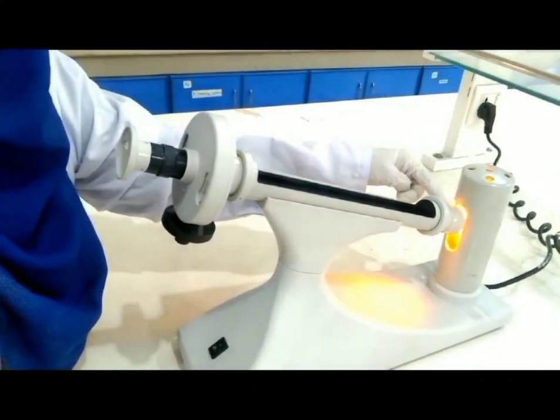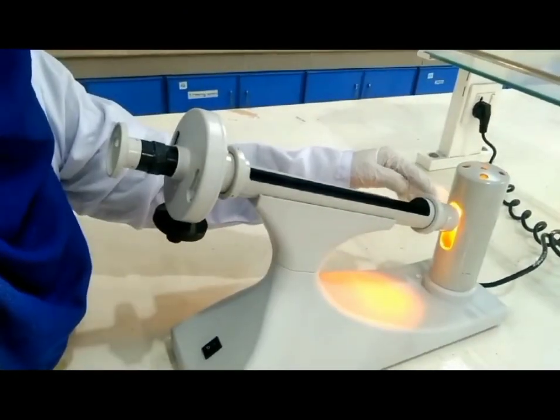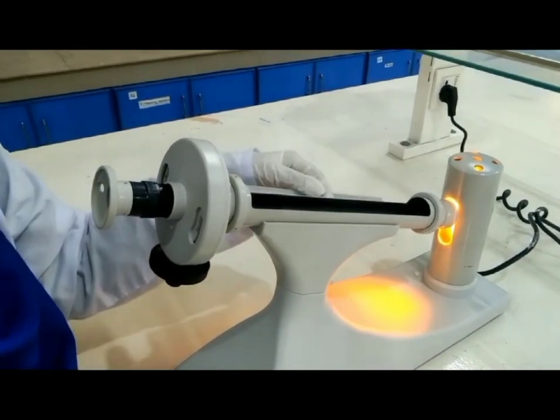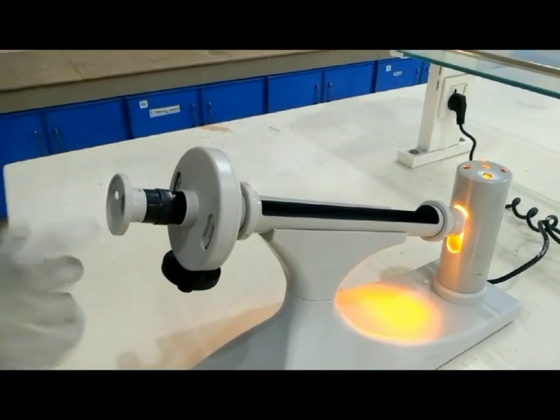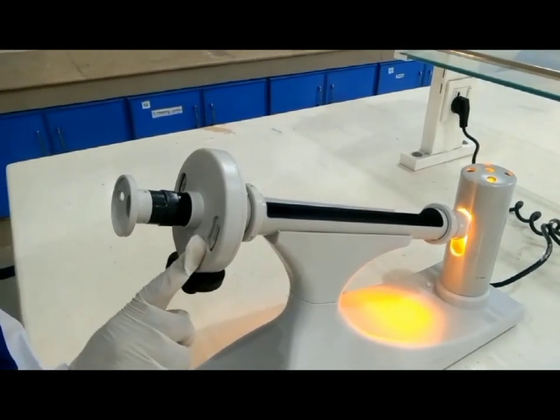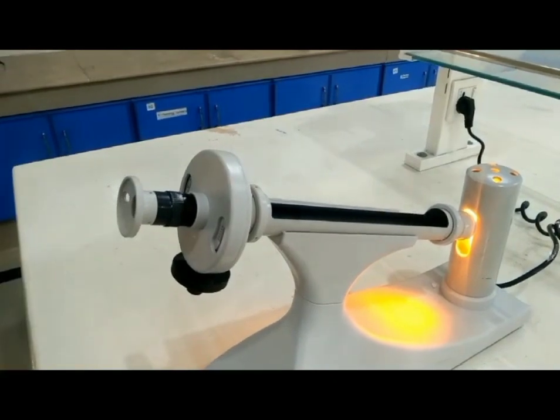Now we will discuss the parts of the polarimeter: sodium light, collector lens, color filter which only allows sodium light to pass out, polarizer, half wave plate which shows the four regions: full bright, full dark, center bright, center dark. The sample tube is put inside this region, metallic jacket. After this region there is the analyzer, object lens, vernier, main scale and vernier scale, rotatory head, object lens.